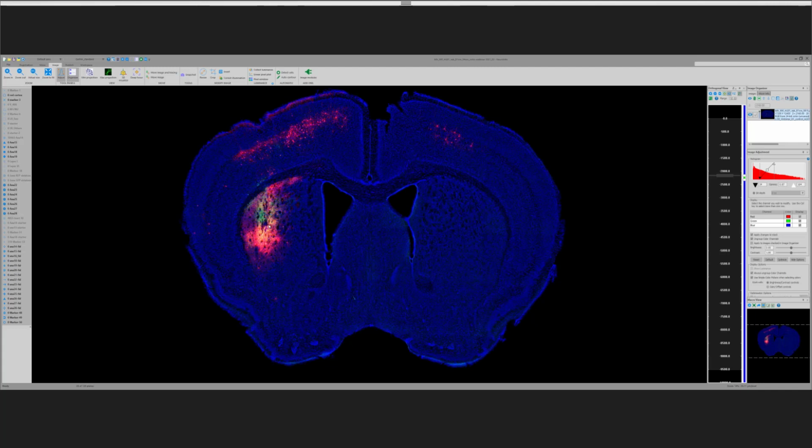This is in a Parkinson's model. So we compare the projections from the cortex, thalamus and globus pallidus to the D1 neurons in normal animals, animals that have been treated with 6-hydroxydopamine to deplete dopamine in Parkinson's models, and then animals that had been treated with L-DOPA that display dyskinesia. What we wanted to do was to register and count the neurons in different areas of the brain from these different experimental conditions.